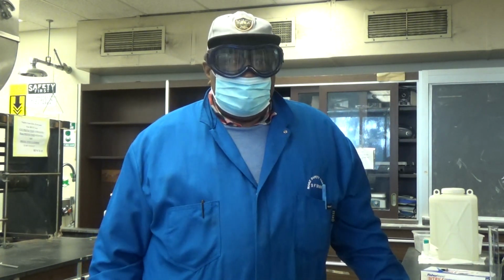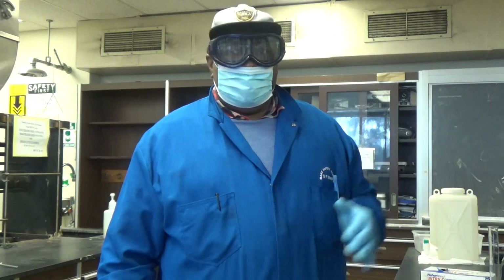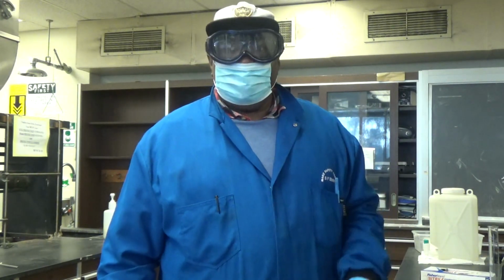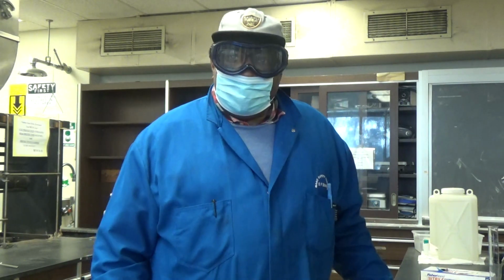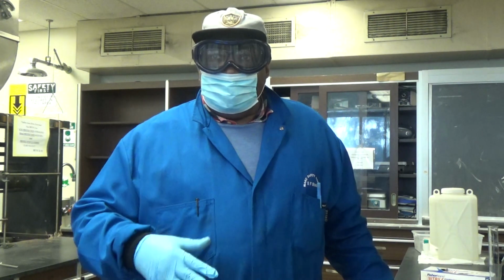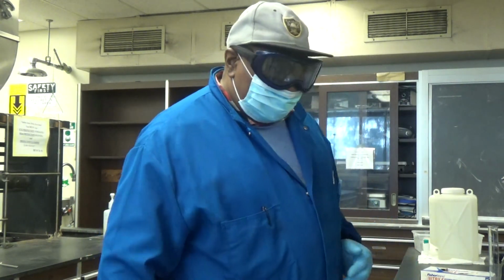So today you are going to do a synthesis of benzil. With benzoin as our starting material, you are also going to use ammonium nitrate and copper acetate. So you're making benzil, B-E-N-Z-I-L, from benzoin. We'll draw it on the board later. Okay, so what do we need?